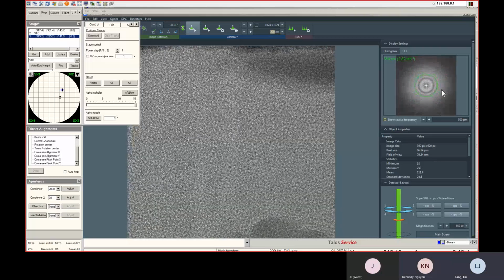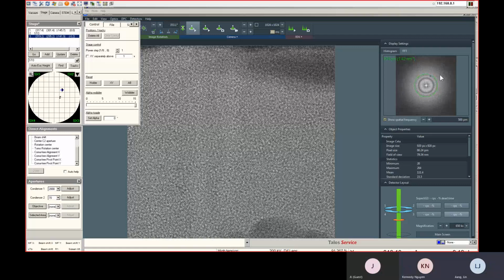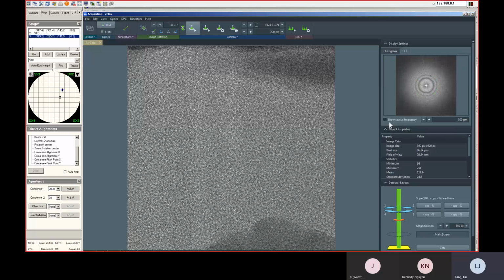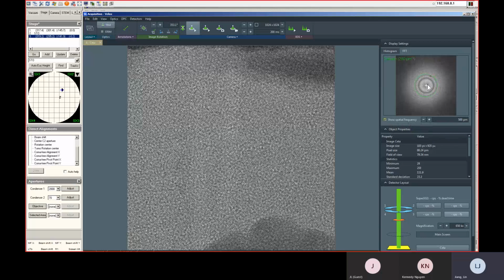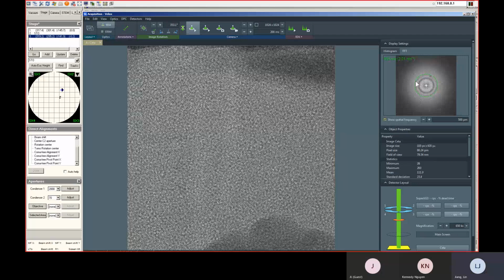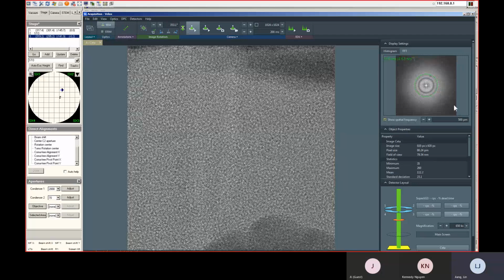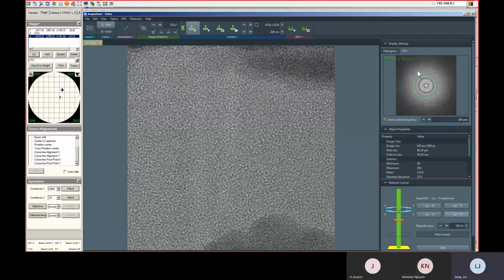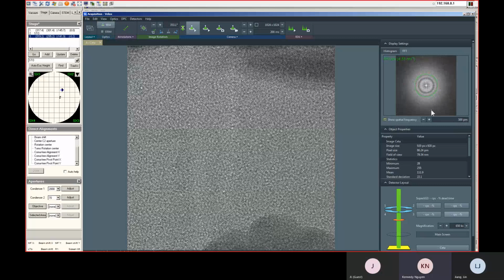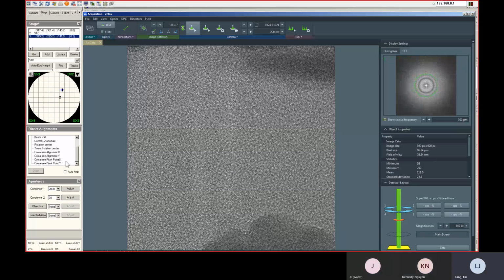How did you get this green ring? The green ring is a frequency marker. The spacing indicated by the green circle is 500 picometers. It's good to see for the objective. It makes it pretty round. Check the coma-free X and the Y again.